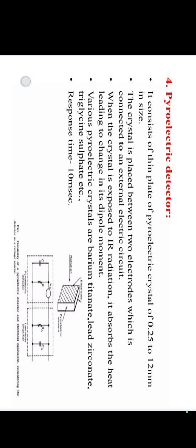The pyroelectric detector parts are the pyroelectric element, electrodes and resistance. They are present in two electrodes, one is the cathode and the other the anode, and lead is present in the pyroelectric detectors.